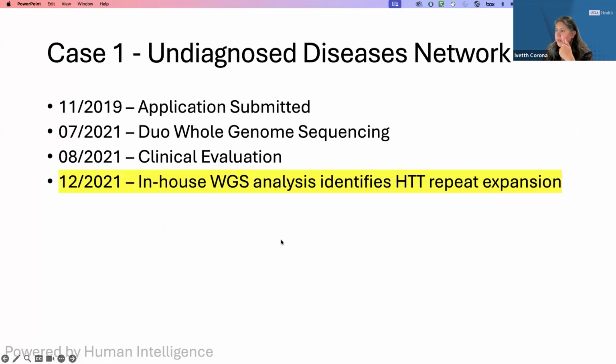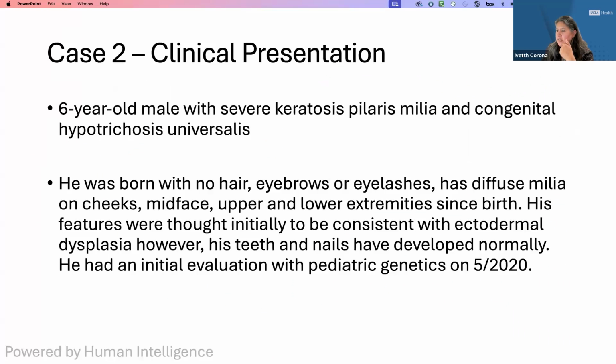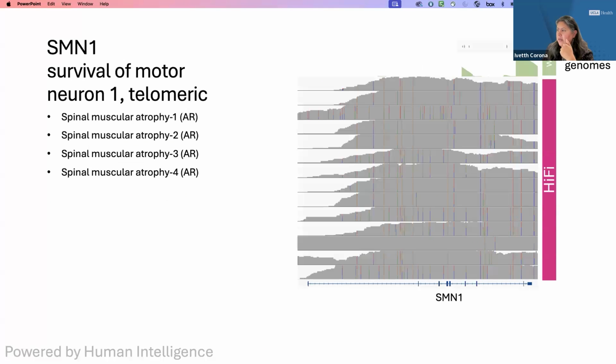So that's what I heard about these, what I call problematic genes. That's what the clinicians in the room were telling me. I'm not a geneticist, I do the analysis, and basically with every new case I don't know about the disease itself, but they told me that there are a set of genes that, because they have pseudogenes, are problematic, or regions that are not easy to resolve by short read. So my idea is that long read can resolve this.